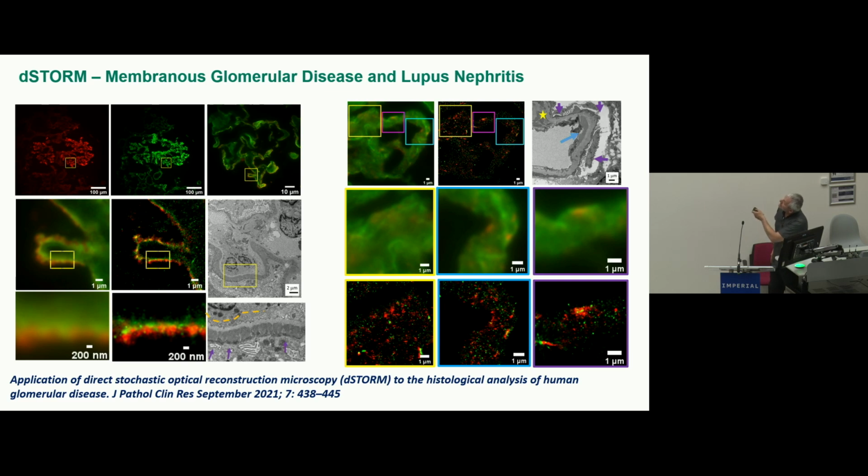When you move to 100x, the expert tells you, I need to look at this area, and this is what you barely can see. But as soon as you go into super resolution, you can see in red this deposit with greater resolution.